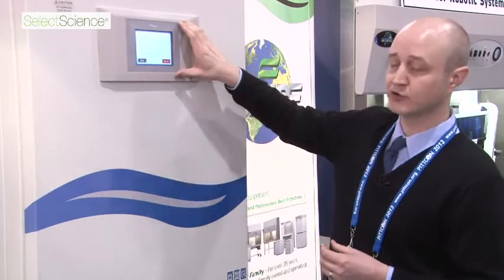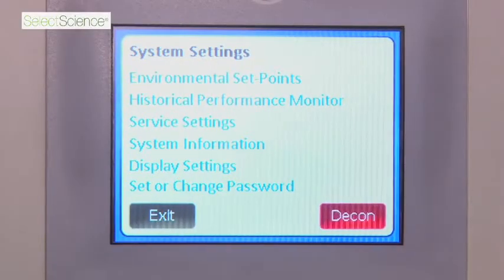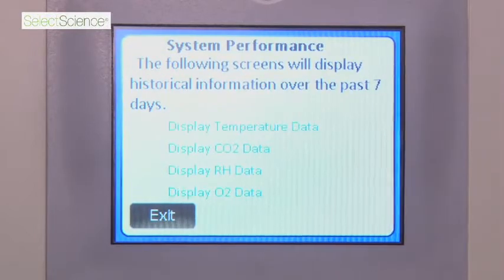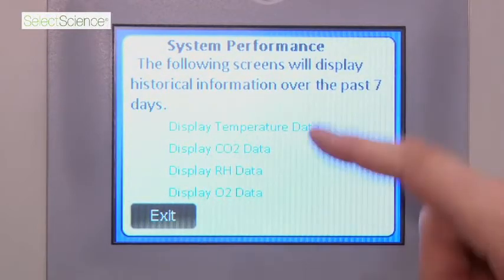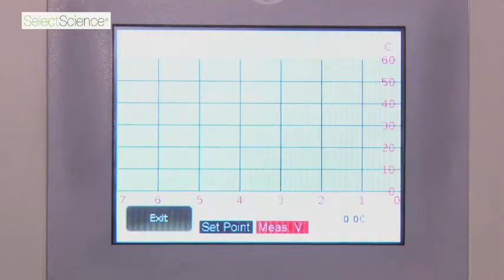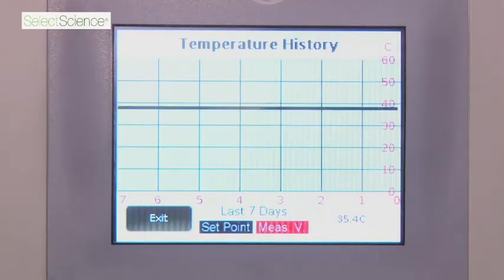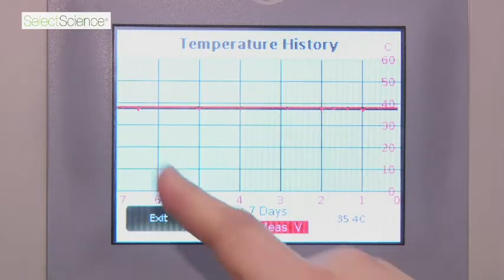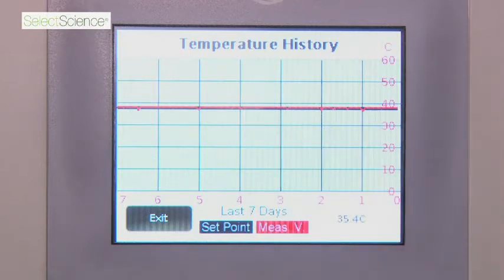Here are all your controls on the inside, including your set points. A nice feature is that you actually have a historical performance monitor. It gives you a readout and a graphic display of temperature and temperature history. You have a black line that is your set point, and then the red line is your measured point. So you can see that if you are away for the night and there is any large spike in activity, you can tell whether your samples have been affected or not.